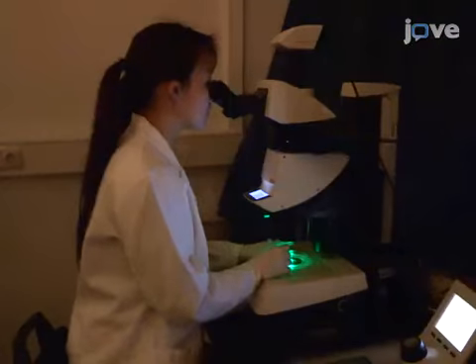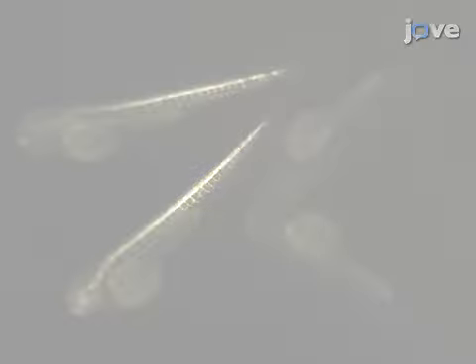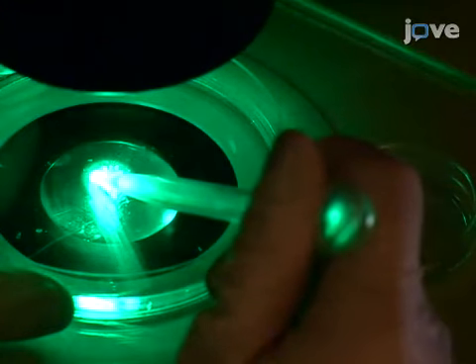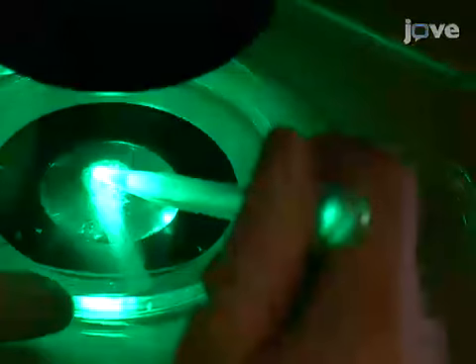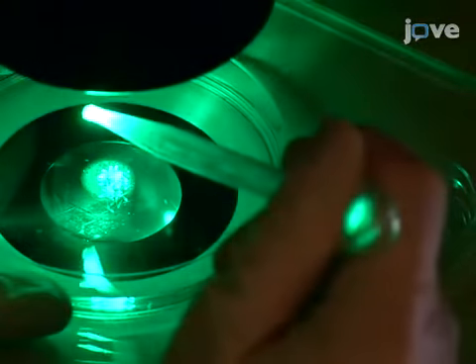On the day of the imaging experiment, use a fluorescence dissecting microscope to screen and anesthetize embryos for transgene expression. Then transfer the selected embryos to a separate petri dish containing Danieau buffer with 1X PTU and 1X tricaine.